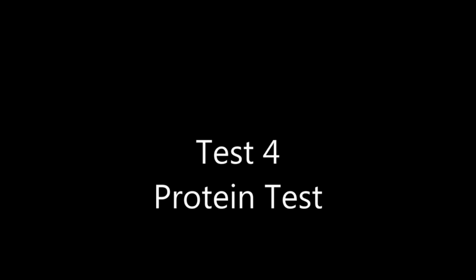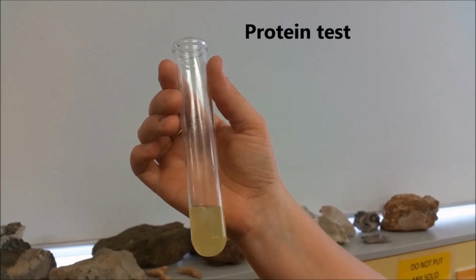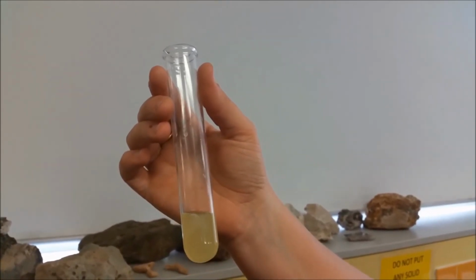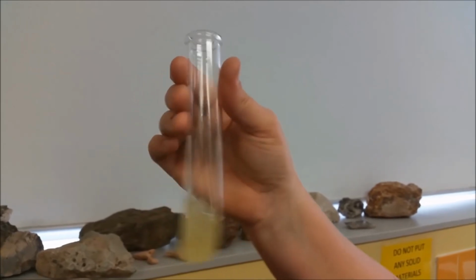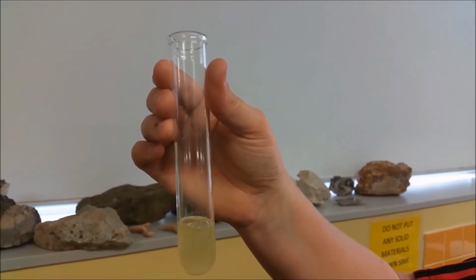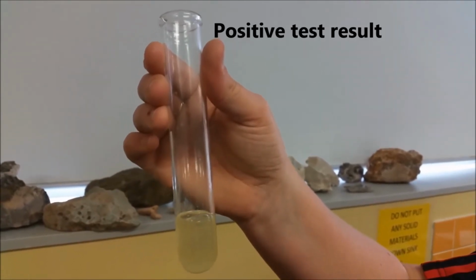Okay, this is the fourth and final test for the food test that you guys will be doing, and today we're going to be looking at protein. As I did with the other ones, I've put protein solution inside the test tube. This is a protein solution. Our positive test result to know if protein was present, what would actually occur?